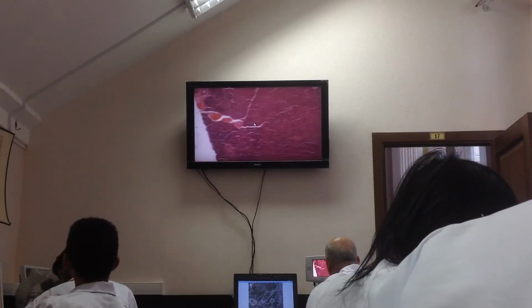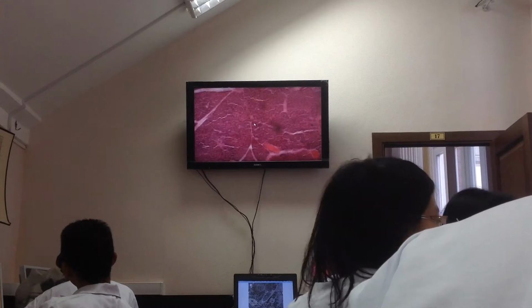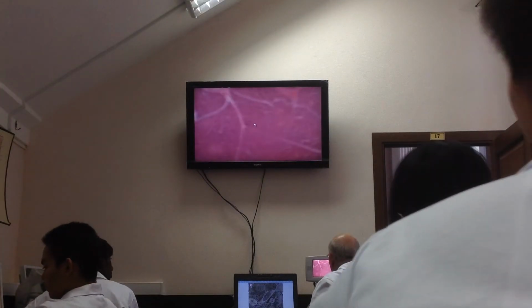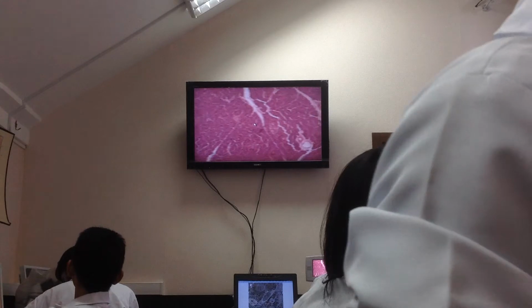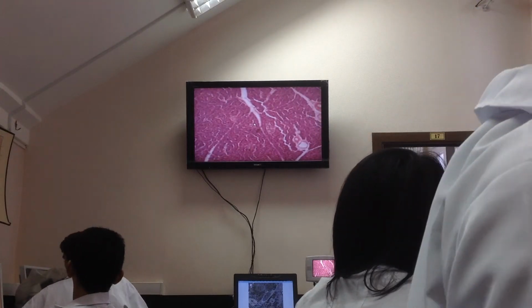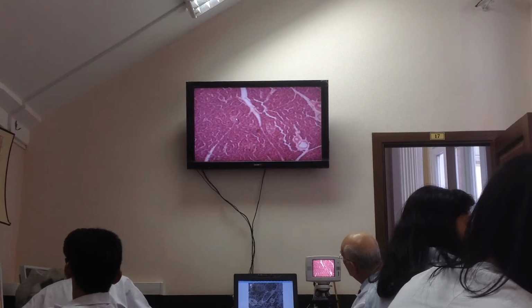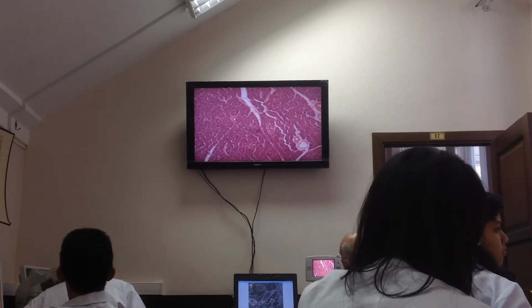Depending on the mode of coloration, we can find the endocrine islets more easily or less easily. Let's examine this section. I want to show you the islets, well colored, well developed. Here islets are present, but coloration is not so good. Look, you see a group of cells. Compact cellular groups situated between acini.